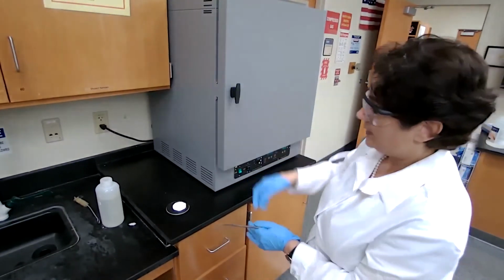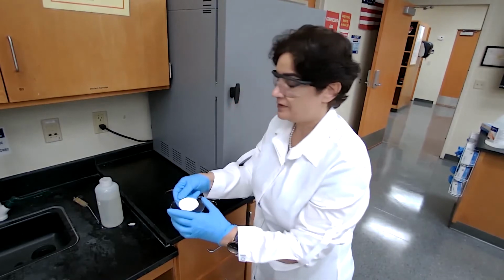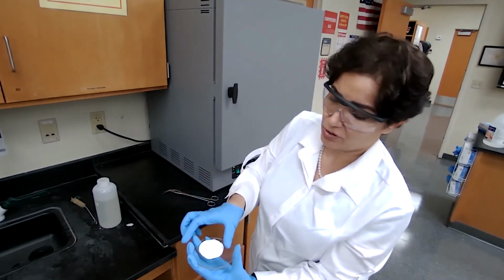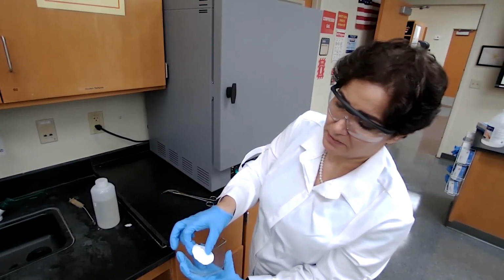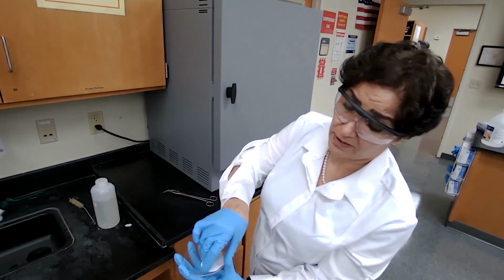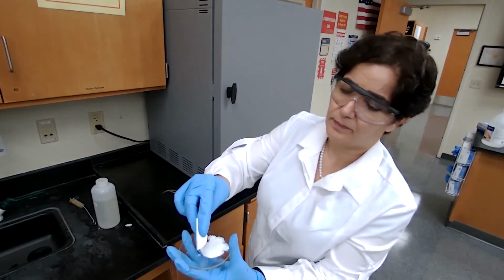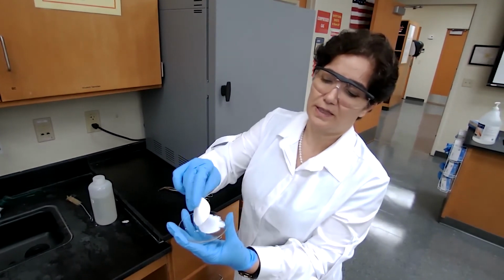Now, is this sample dry? I usually tell the students, if the paper is dry, the sample is dry. If I move this around now, I can show you that this paper is crisp. Okay. This paper is crisp. It's not wet. If it's wet, it would fold, and you could see.